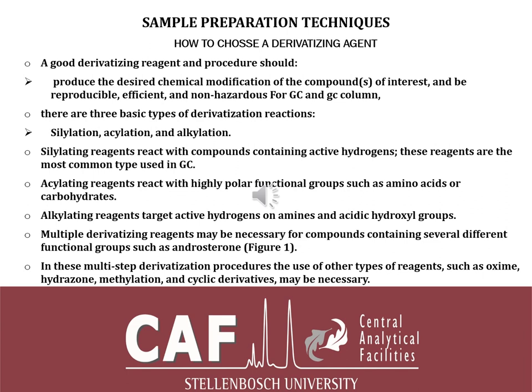Just to stop there, for instance, one may say that one should never ever do something. For instance, when you derivatize with any TMS, trimethylsilane, you should never ever inject those samples on a polar column, because you will definitely damage the column. So when you're doing silylation, you have to use a non-polar column. There are three basic types of derivatizing reaction: silylation, acylation, and alkylation.